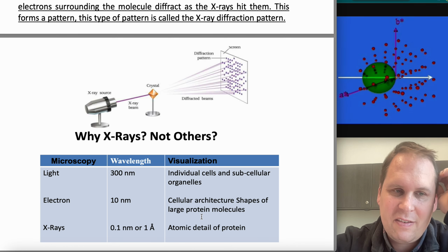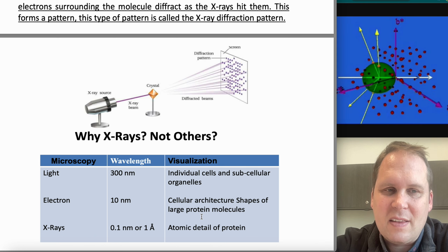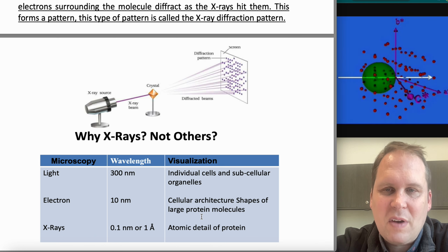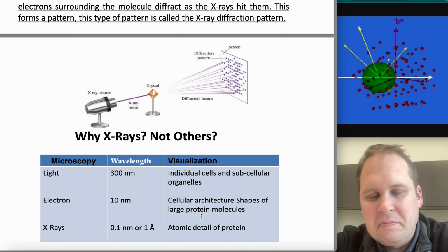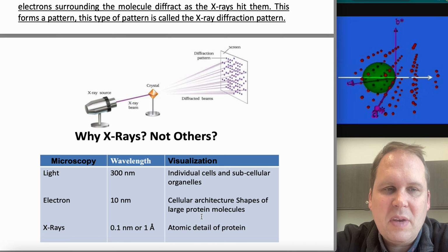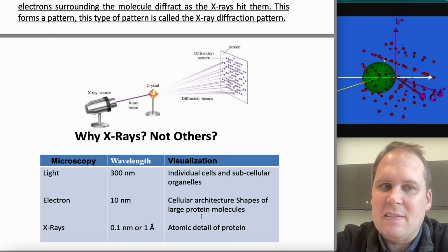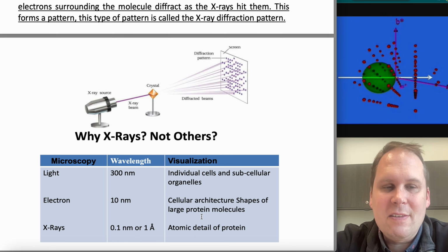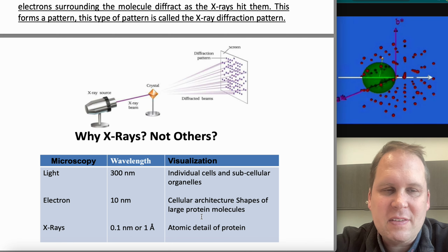And if you have enough data from these electrons, you can actually reconstruct molecular models down to 2 or 3 angstrom resolution with the best techniques. And that's really something. And so that's nice because it's a different way of doing this. It's not dependent on the crystal.